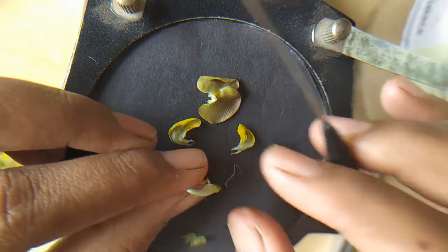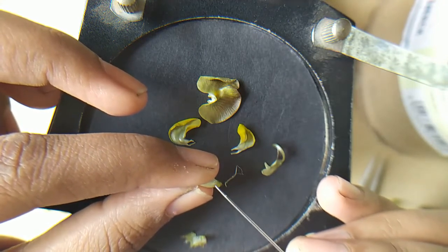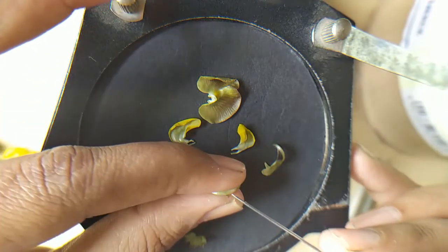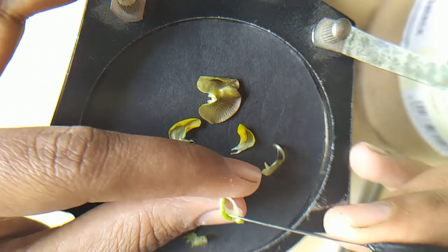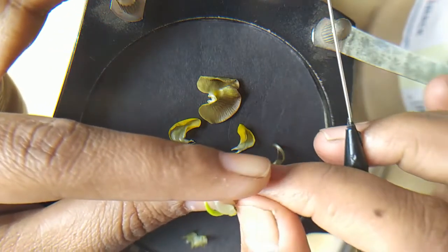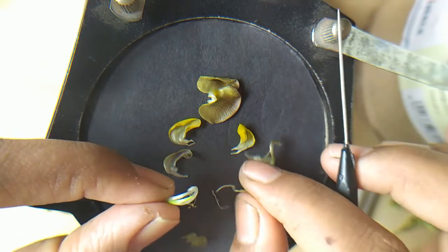The cut should be given from the back of that bunch of 9 anthers, and then gently pick up, and care should be taken that it should not be cut into pieces. By mistake I have cut my gynoecium here.